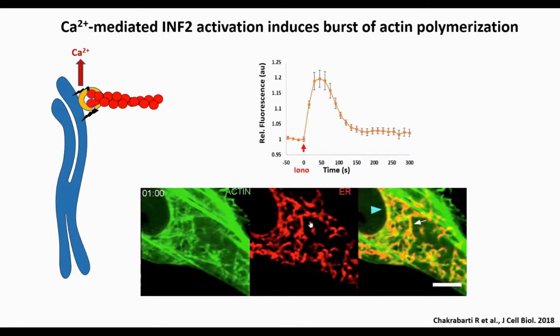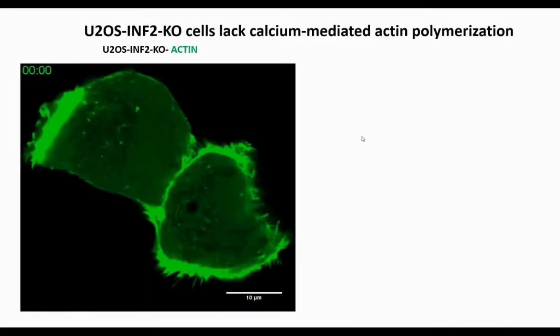And we can measure this in this graph over here. So where we add ionomycin, we see a curve of actin filaments go up, and it goes down by about 100 to 150 seconds, which, let me remind you, is typically a similar time to what we saw for the cytosolic calcium spike. So it's pretty much in that same ballpark that the actin filaments form and disappear.